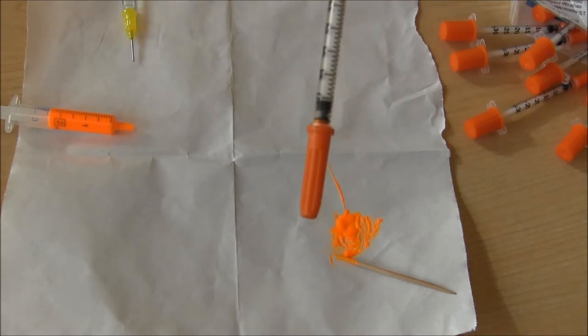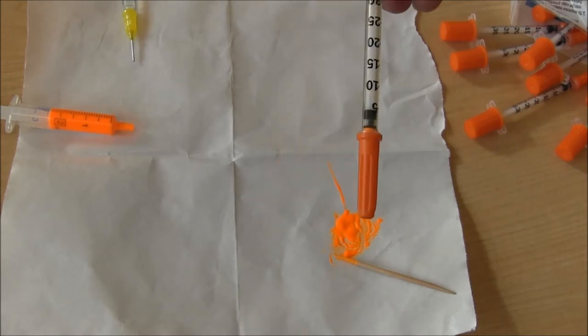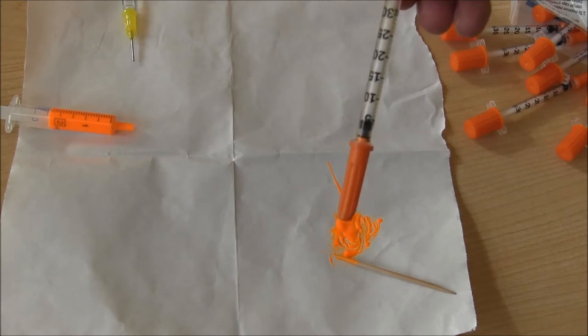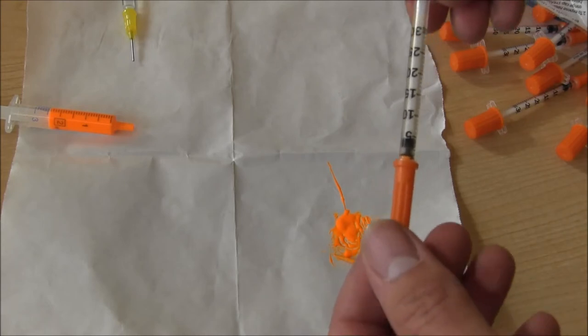You definitely do not want more than one mark's worth for marking plethodontid salamanders. You might want to load syringes with more if you're going to be marking larger amphibians, such as ambystomatids or vernal pool breeding salamanders.